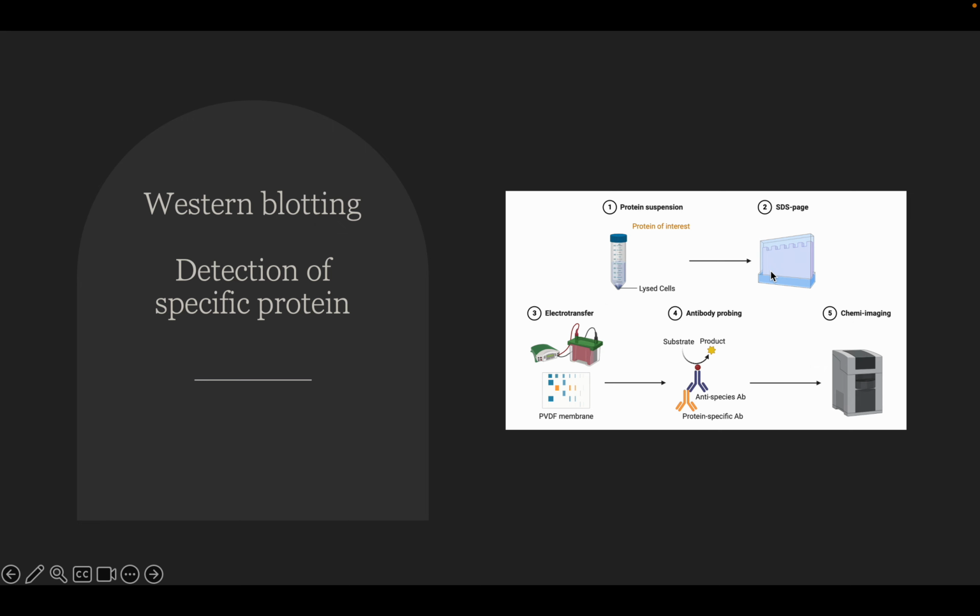One is called the denatured gel, another one is called the native gel. The denatured gel is also called the SDS-PAGE gel, because in this you make all the protein negative and linear. If you change the charge, the protein becomes unfolded and linear, and then it's easy to separate them. In the native PAGE you do not add any charge, and the protein will run based on size and charge everything.